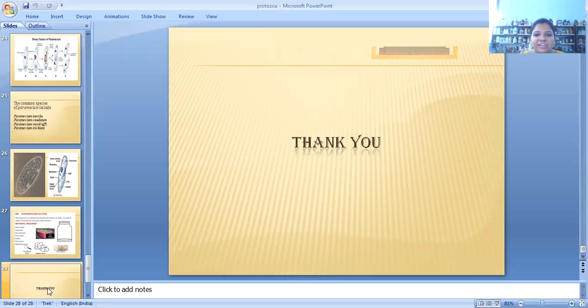Still, if you face any doubts, any difficulties, you all can contact and you can ask your queries. I hope you all are clear with the practicals. What you have to write and mention is you have to just draw the structure of the protozoa. You have to identify it, write its morphological characteristics, write few general characteristics and one or two examples of each of the protozoa.